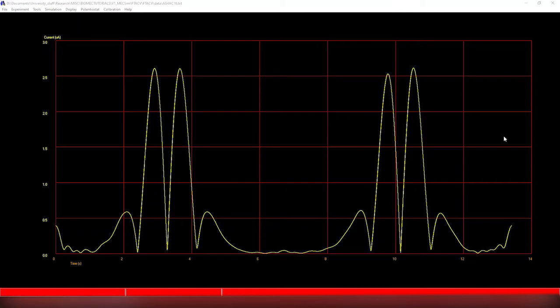The main important thing is you want to take the largest harmonic signal you can as well, mainly because the largest one is going to be your strongest signal with the cleanest electrode and the lowest resistance, which is generally what you're going to want in data, or more abstractly, it's the ideal case.